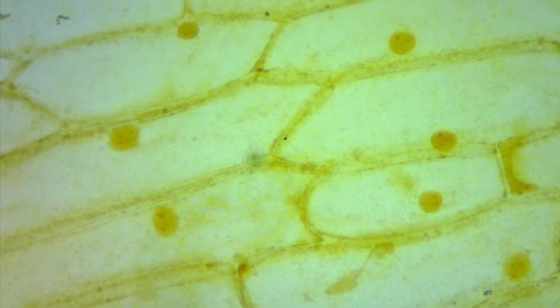The slide is a wet mount. Include the forceps in materials, the onion, the cover slip, results and conclusion.